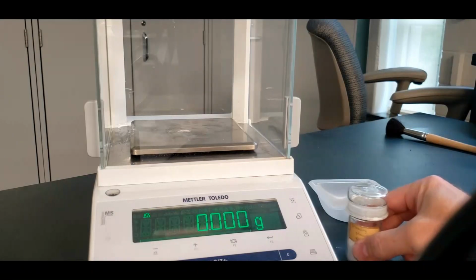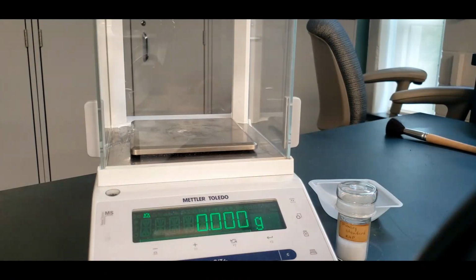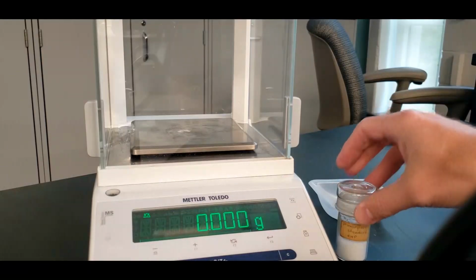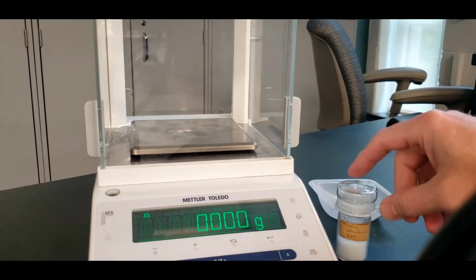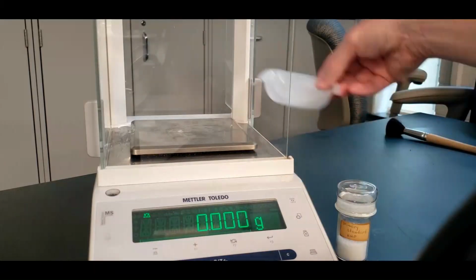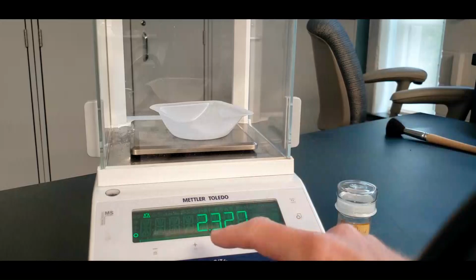We just have this. Now this is going to be a little tricky to do without blocking the camera. So I do something a little different than the lab book says. I'm going to use 0.4 grams. I found that works really well. So I'm going to just put the 0.4 grams in.